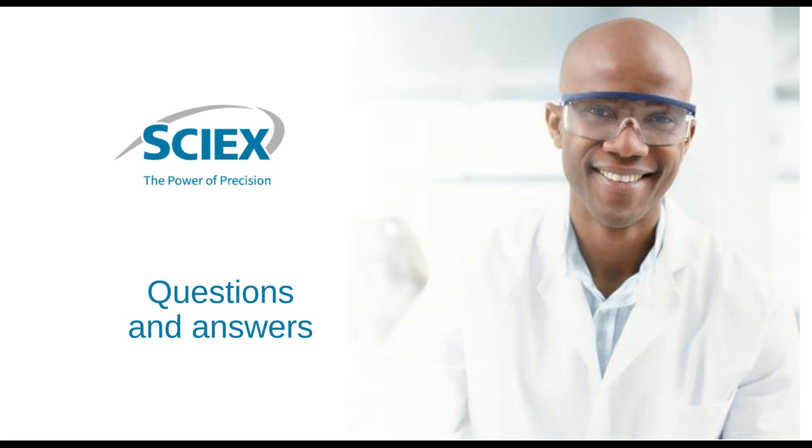But that would be the only thing that I would say to watch out for, is just try to keep the level of ionic strength lower, because we are using electrokinetic injection and we are really pushing the limits of that. So the less salt in there, the less salt is injected. Okay, understood. Great, thanks so much.